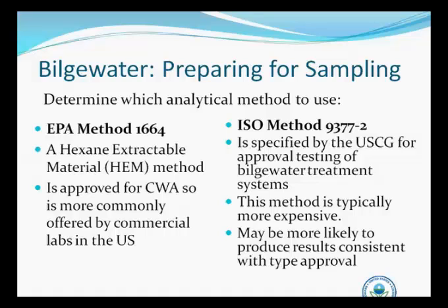Okay, this is Kathleen. I'm going to be talking about bilge water sampling and more specifically the oil and grease samples. And we're going to assume that you have not contracted out someone to do your sampling and that you'll have someone in-house, like your personnel, doing the sampling for you.